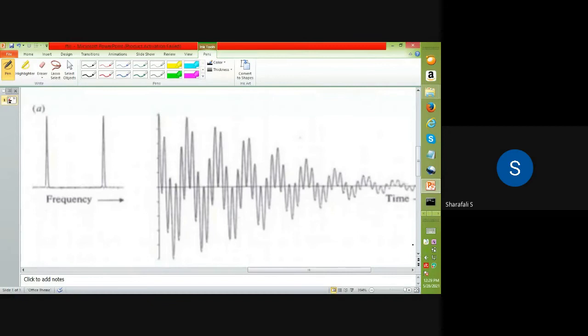So they will differ in the movement of M1 and M2, and then we will get a very complicated spectrum. With the interference of mu 1 and mu 2, we will get this kind of structure with the beats, different beats.